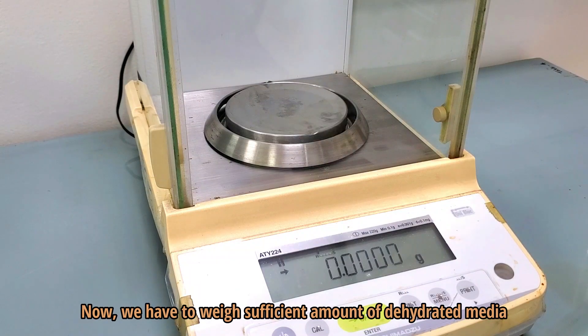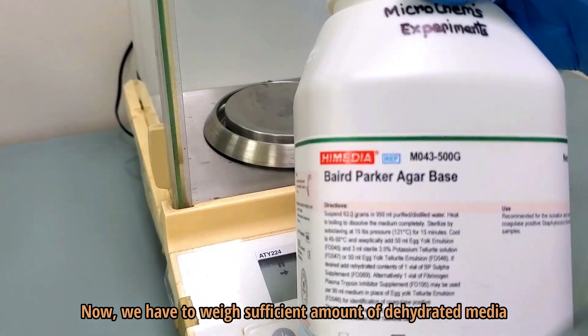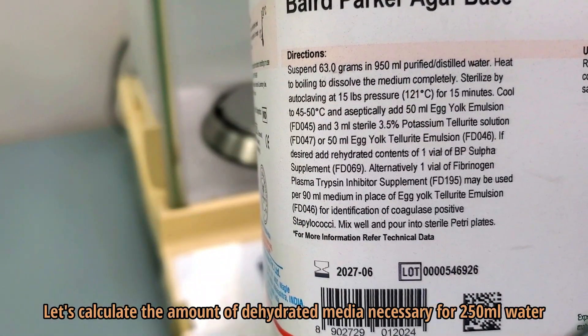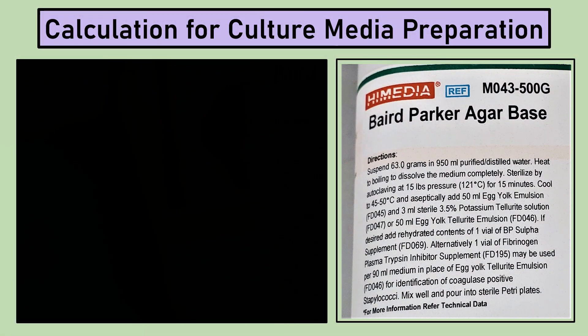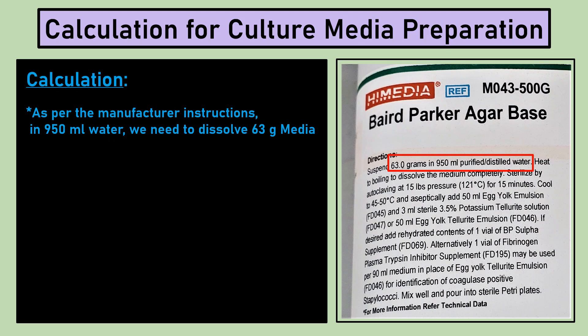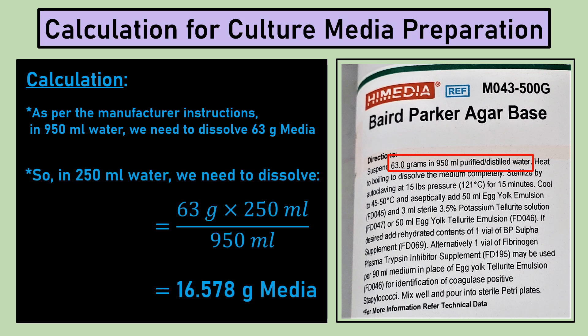Now we have to weigh a sufficient amount of dehydrated media. Let's calculate how much dehydrated media is necessary for 250 millilitres of water. As per the manufacturer's instructions, we need to suspend 63 grams of media in 950 millilitres of distilled water. So in 250 millilitres of water, we need to dissolve 16.578 grams of media.